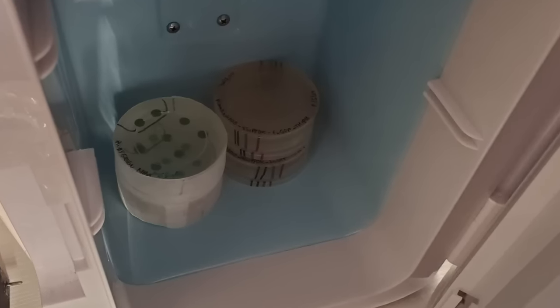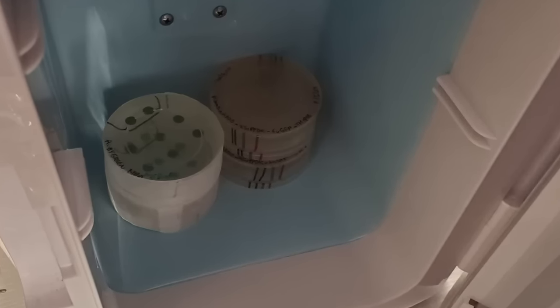So you're purposely contaminating your plants with bacteria. And if you wait the 72 hours, it's around the time that it takes for Agrobacterium to transfer its DNA fully, right? Just like how we get signal in 3 days, similar process. And then you want to kill the Agrobacterium and keep the plants, right? And so you move it onto media that has antibiotics that kill the Agrobacterium.